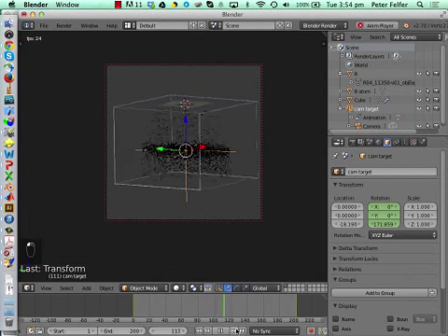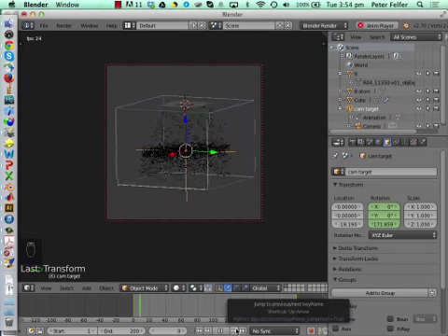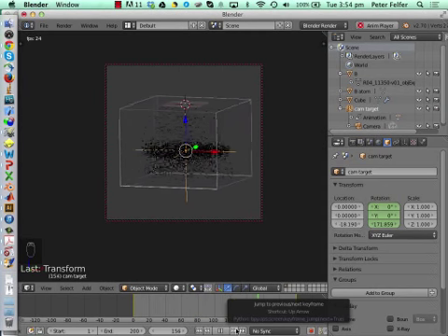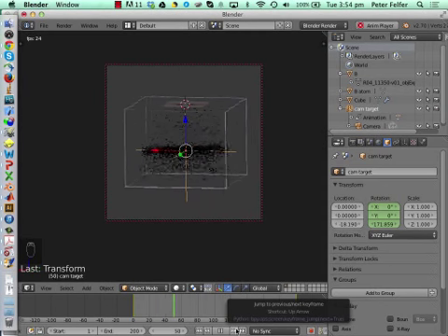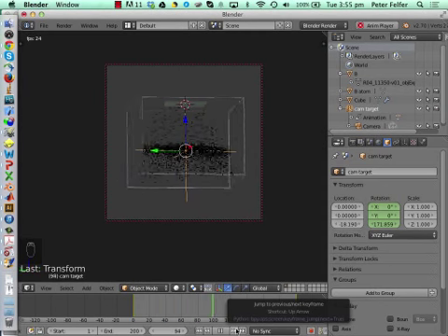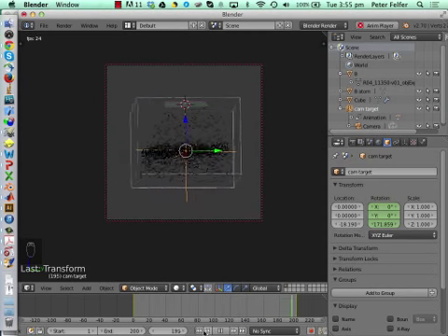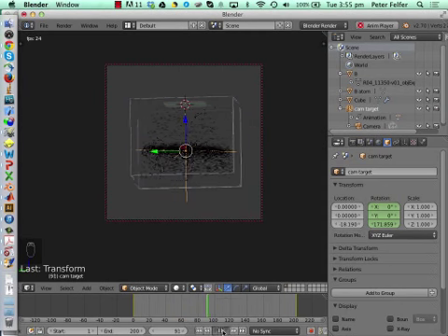And now we've got it much slower, and we've got our rotation animation here. You can animate pretty much anything: sizes, shapes, locations, and so on. But I think that's the most common animation you'll probably do for your Atom Probe data. And this is now perfectly ready for being looped.